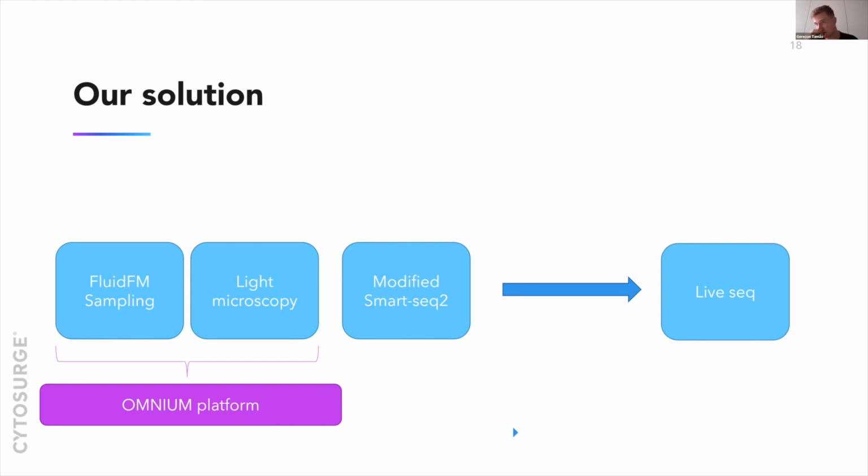In this study that I have showed you, it was transcriptomics. But of course, there are also proteins in that little extract. There might be organelles. There might be many different things that can be characterized. So this is for us a very interesting direction in the future. What anybody can use these extracts for, in terms of really observing how the cell's trajectory goes over its lifetime.